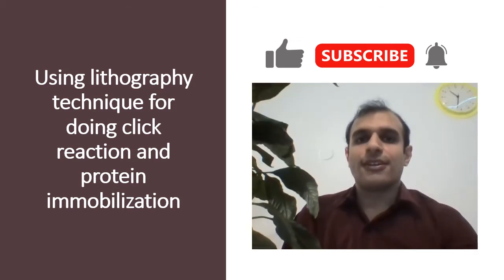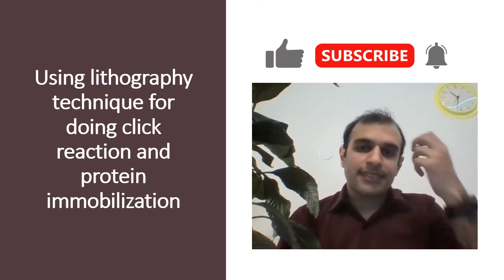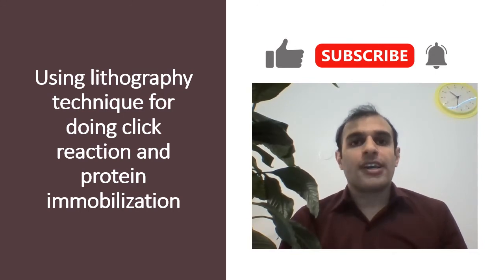My name is Mahdi.Far. Today in this video we will learn how to use the lithography technique for printing molecules on a surface, doing click reactions, and also protein immobilization.